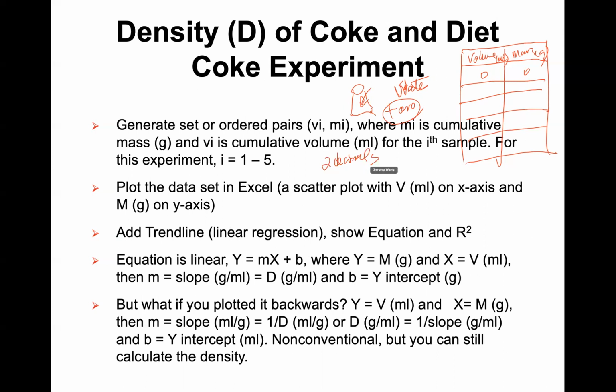So we can say you added 1.20. Make sure to keep the 2 decimals. As I said, these numbers are very important. Then you measure the mass. Then you add another one to the same flask. We added a lot of milliliters to the flask, so the total volume changes to 2.20 now. And you have another mass here.